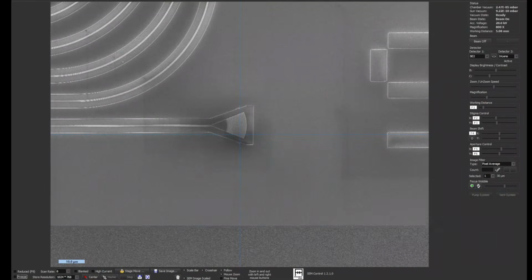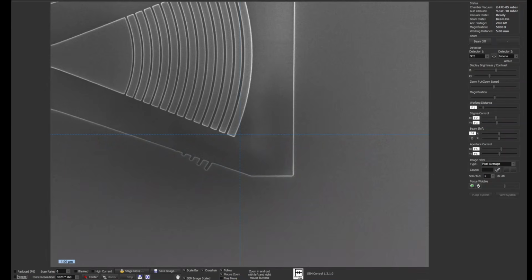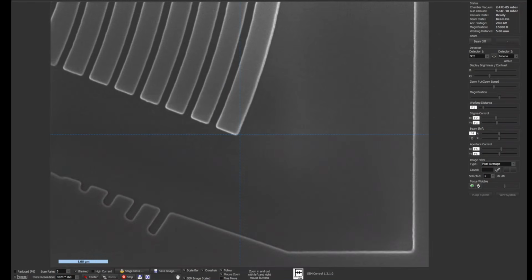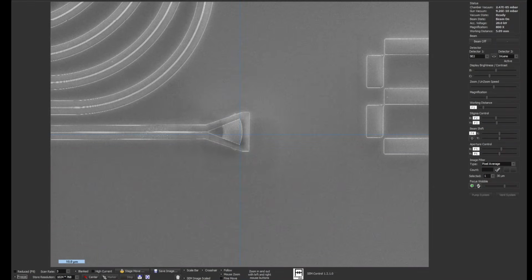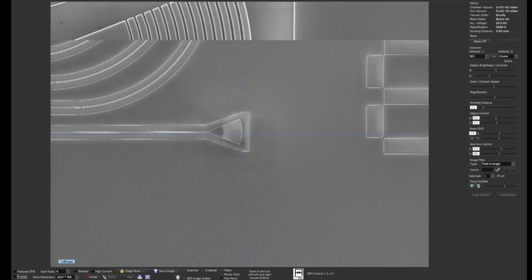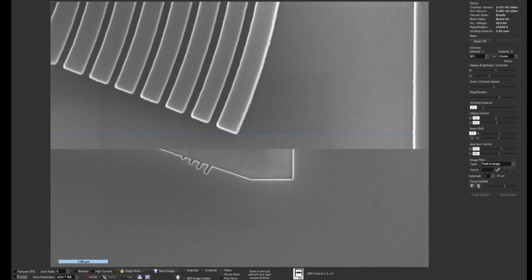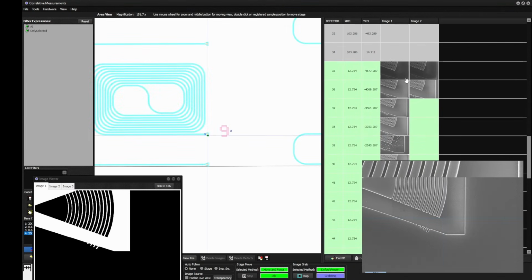Let's watch it on the SEM side. We have the first image, then comes the second image, and then another refine, and then comes the image which should be quite perfectly centered. Next area, first step, next step, and this hits exactly. Yeah, that's how it should be. It has created two images.